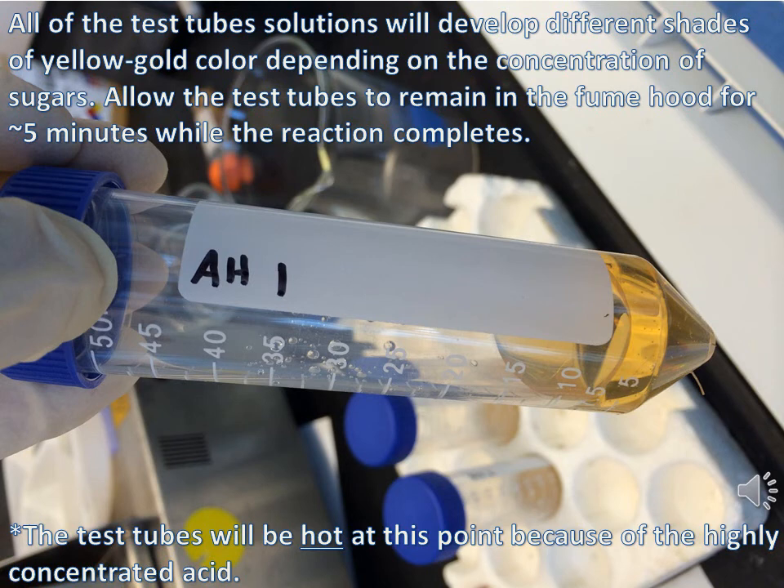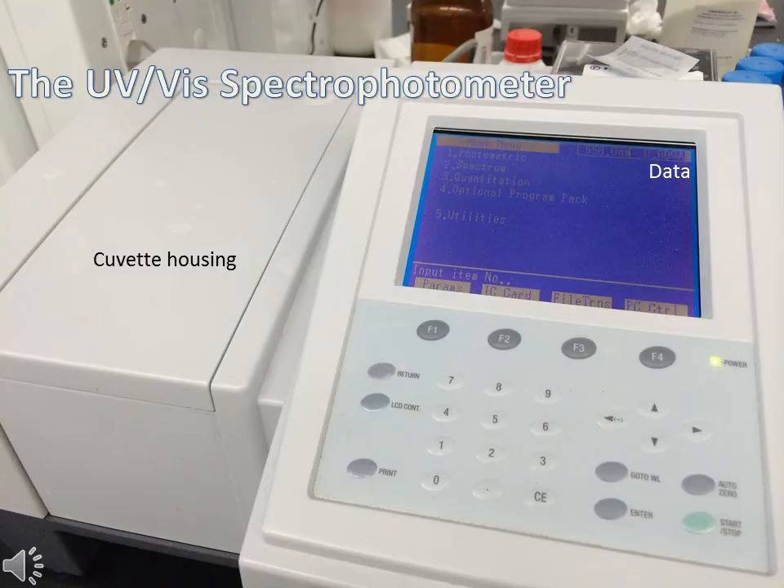Allow all of your test tubes to remain in the fume hood for about 5 minutes while the reaction goes to completion. You should notice a yellow-gold color of different shades depending on the sugar concentration you have in each test tube. Take your prepared test tube rack to the lab's UV-Vis spectrophotometer.